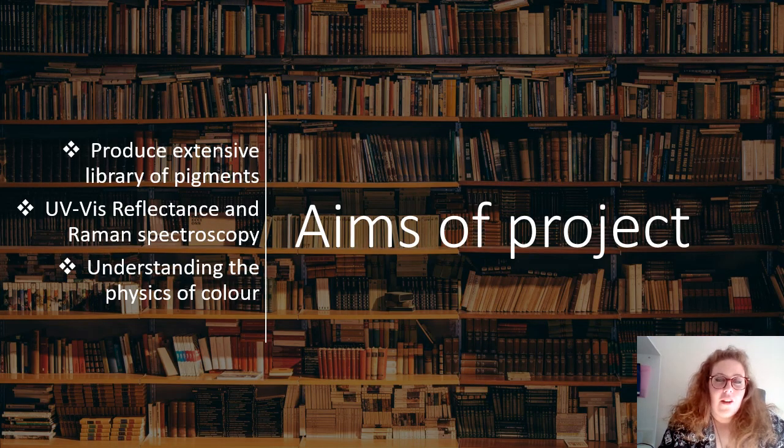To bring things to a close, the final aim of this project will be to produce an extensive reference library of different pigments that can be used in the art history field to aid in restoration, preservation and authentication. But along the way, we will understand how both reflectance and Raman spectroscopy work and how to perform them. And finally, I hope to gain a detailed understanding of the physics of colour.